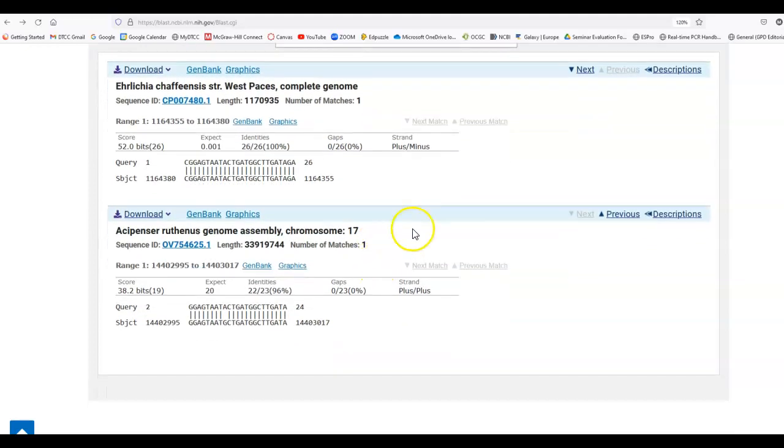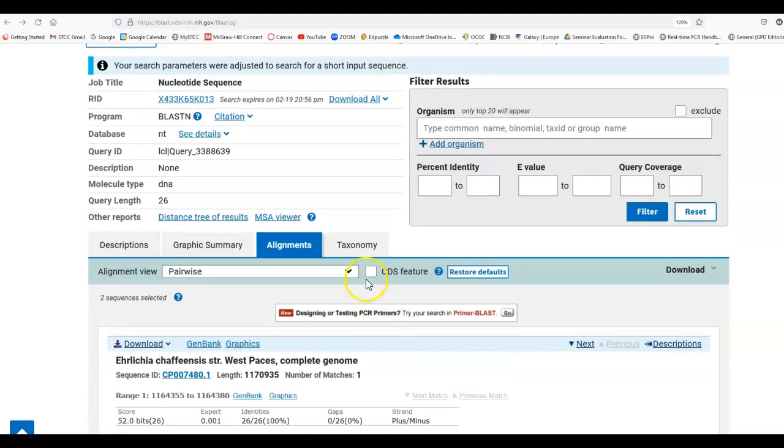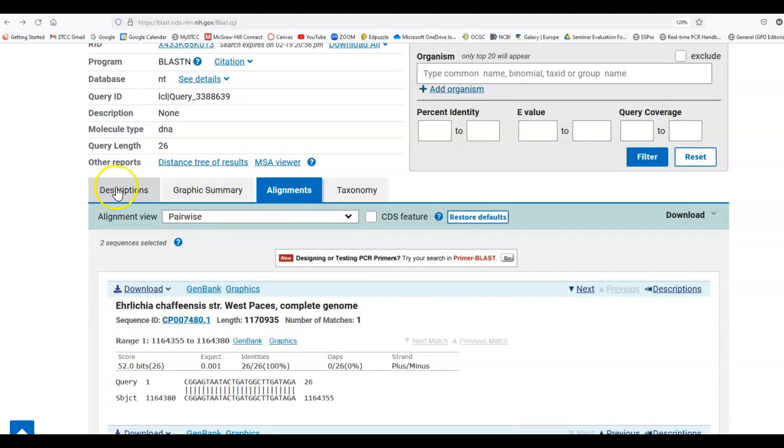So now we see the other one I chose. And this one has a lower score, first of all, right? And what we end up getting is a different combination of potential identity. We see that there's a difference here, an A and a G, and so that's going to lower the identity a bit, and so that would make it a lot less likely to be obviously number one the same thing, but if you were using PCR it wouldn't be as efficient. So that's kind of the idea of what those numbers mean when you actually get the results back of all of the other things.